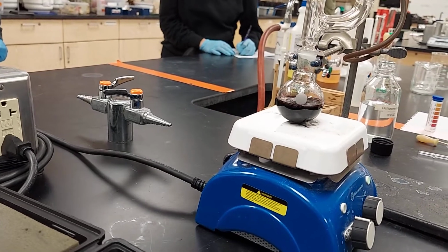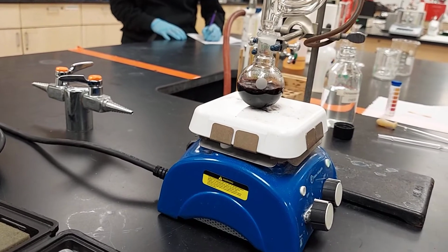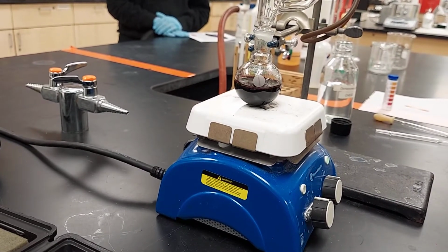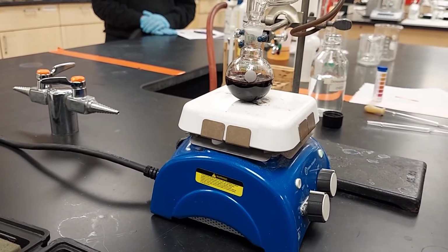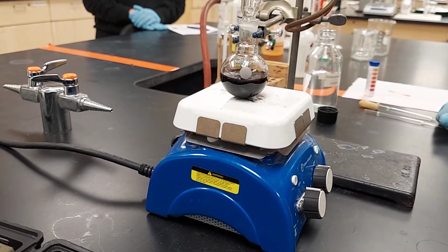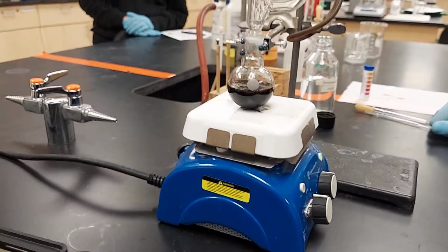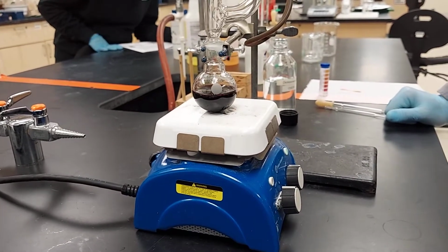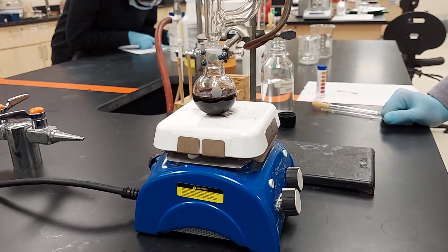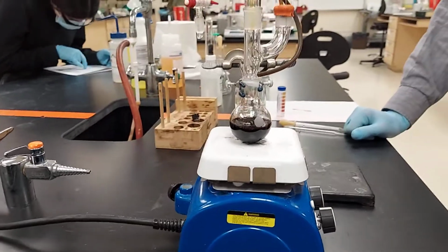Nice spinning, adding slowly. And it says we're going to take a sample. TLC aliquot. We're going to take what's called an aliquot sample. Does it say after we've added it slowly to do that? Yes. Okay, so after this addition is complete, we're going to take what's called an aliquot. It's a very strange word that means a very small sample. And it's going to be for TLC. And pay careful attention to today's TLC because it's exactly the same as the final exam TLC. We'll do that on a separate video.